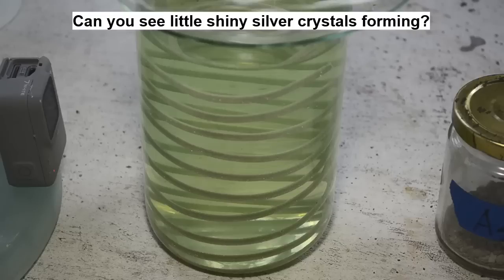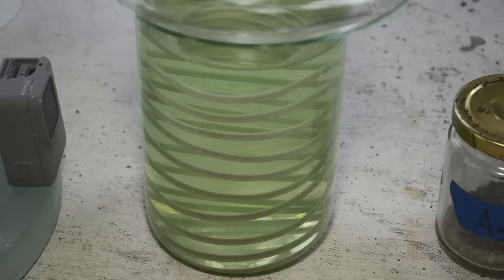We'll collect the silver that falls to the bottom of the beaker, and probably boil it in some sulfuric acid and see if that seems to clean it up. Okay, so just gotta let this go.